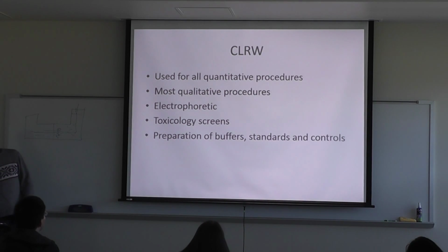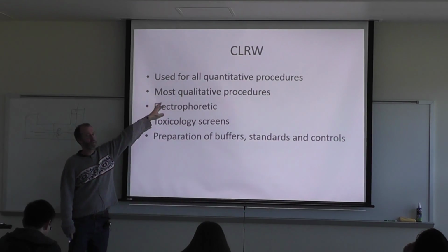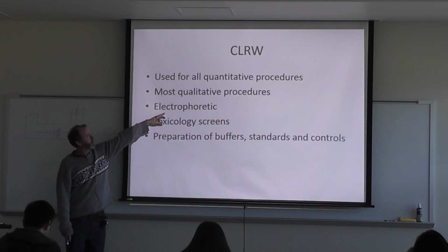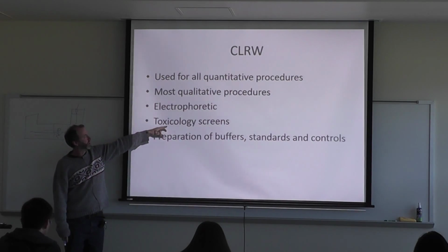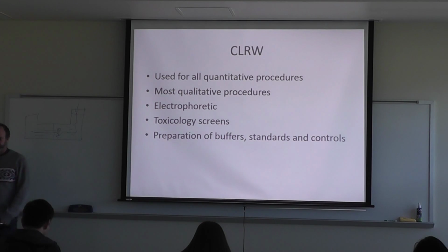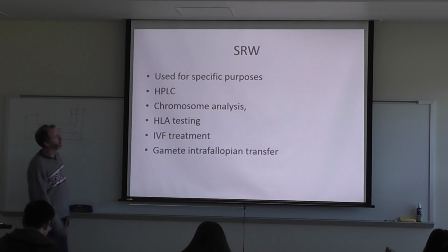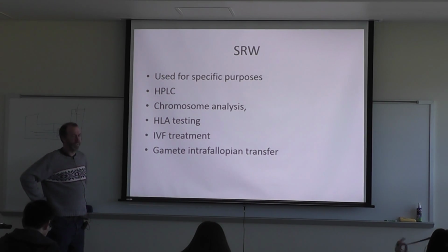So clinical laboratory reagent water is used for all quantitative procedures and most qualitative procedures. It's used for electrophoresis, toxicology screens, and it's used to prepare buffers, standards, and controls in the lab. So, what was the S again? Special reagent water, I forget.